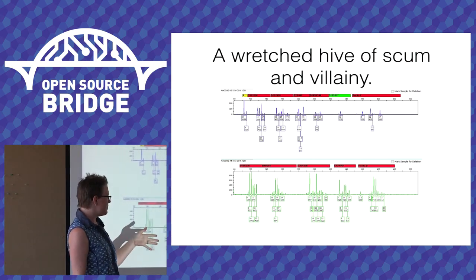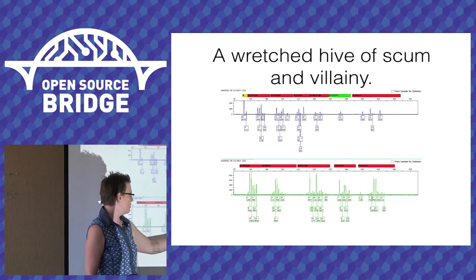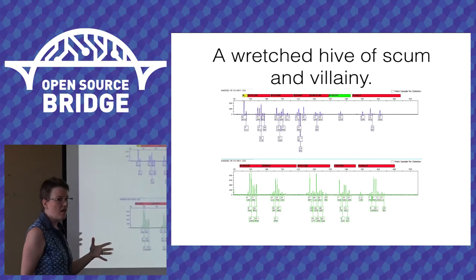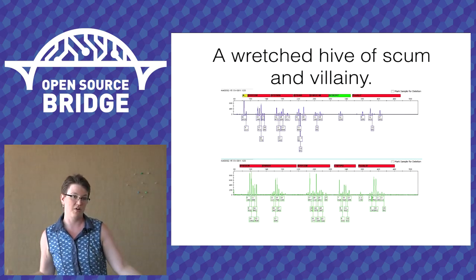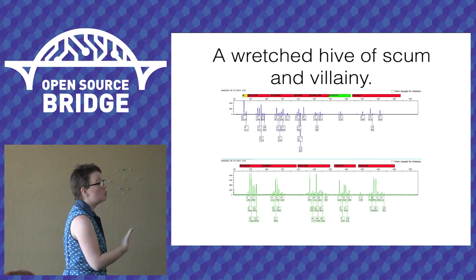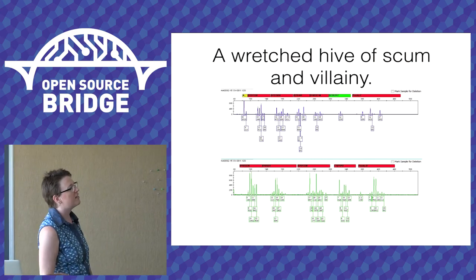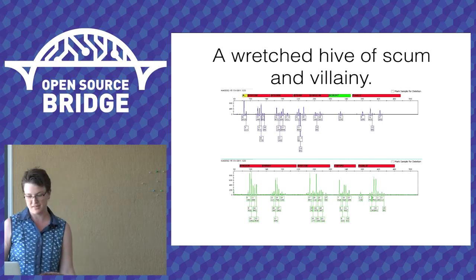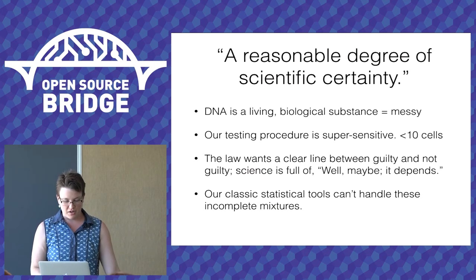This is from a seatbelt in a vehicle that's related to a homicide. Look down here. We've got 10 alleles. One person can give 2 alleles, 10 divided by 2, 5. At least 5 people's DNA commingled. This is useless. This is why I don't like seatbelts, and I don't test them unless it's a homicide, and they're like, please test everything, because a miracle will happen, and I'll get something beautiful. Not this time. Lots of dropout. Not reliable. I only have partial data.